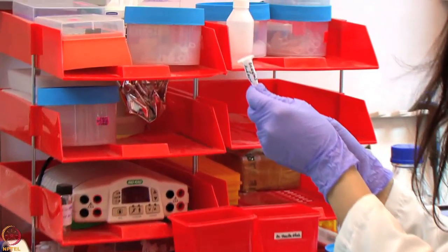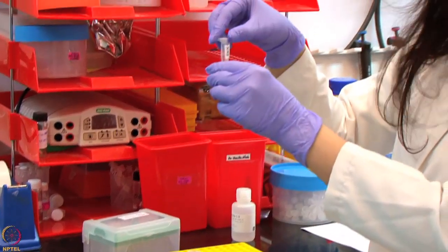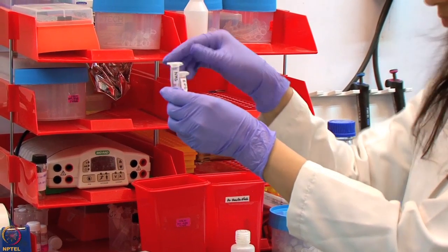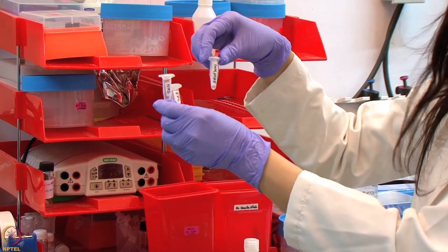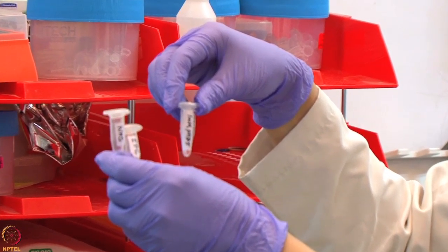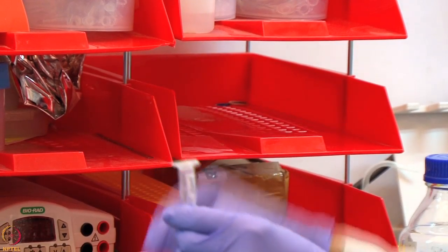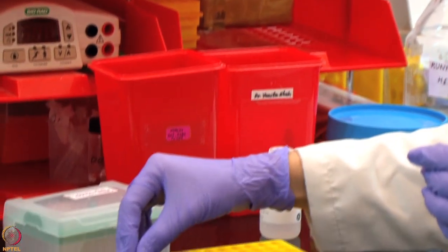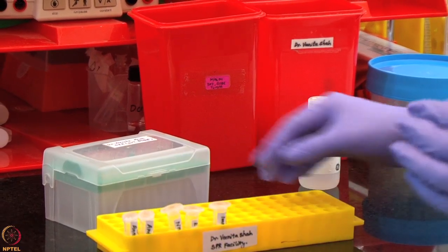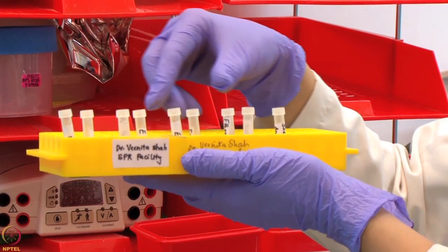This is our 30 microgram per ml ligand solution. Aliquots of NHS, EDC and ethanolamine are prepared and transferred to the specialized tubes used for the system. We have now transferred all the reagents into these specialized tubes.